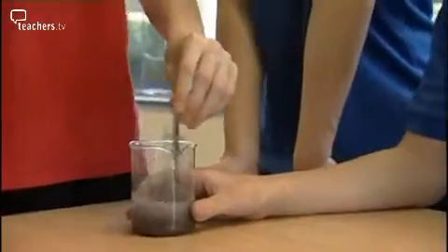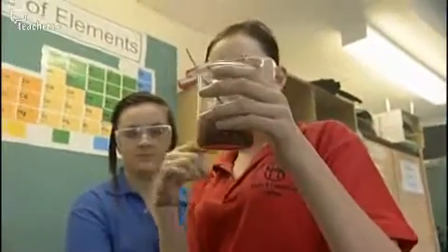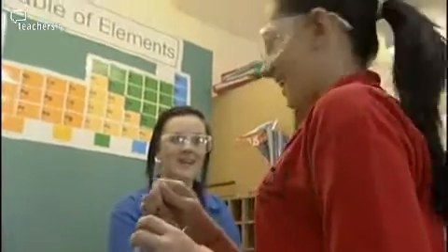It's getting warm, isn't it? It's getting quite warm. Because there's another chemical reaction happening at this stage, there's all sorts of other things that you can get the students to notice. So some of them over there had noticed that the actual reaction is getting warm, and so that again is another example of evidence of a chemical reaction. It's gone like a chocolatey brown. It looks like my hair down when I'm washing my hair.